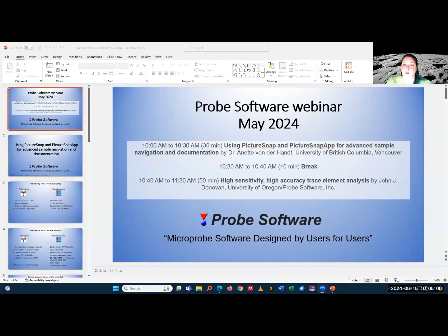Next Probe Software webinar. It's the fourth one, and today we will talk about both PictureSnapApp and high sensitivity, high accuracy trace element analysis.